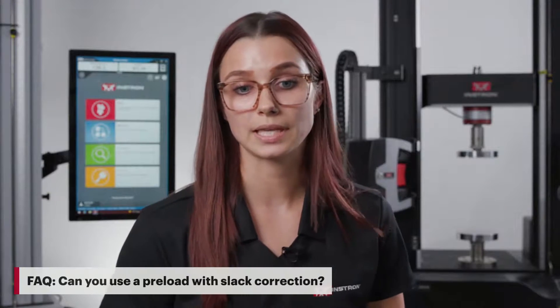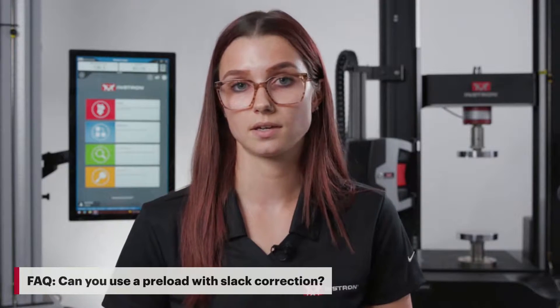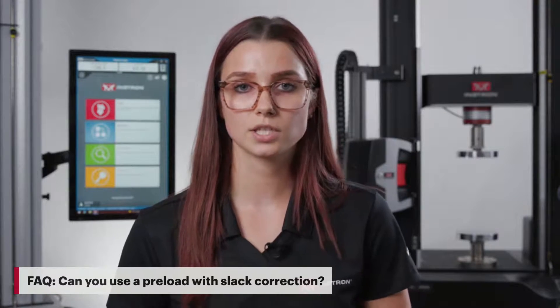So now that we've seen preload and slack correction, let's look at some frequently asked questions. Can you use preload with a slack correction? Yes, you can. It's best to use a preload only for specimens that have the ability to reach a preload value of one newton and also material that has a relatively consistent maximum force. For slack correction, it's used for materials that are either very fragile or very variable within the results. So it's more common to use one or the other.